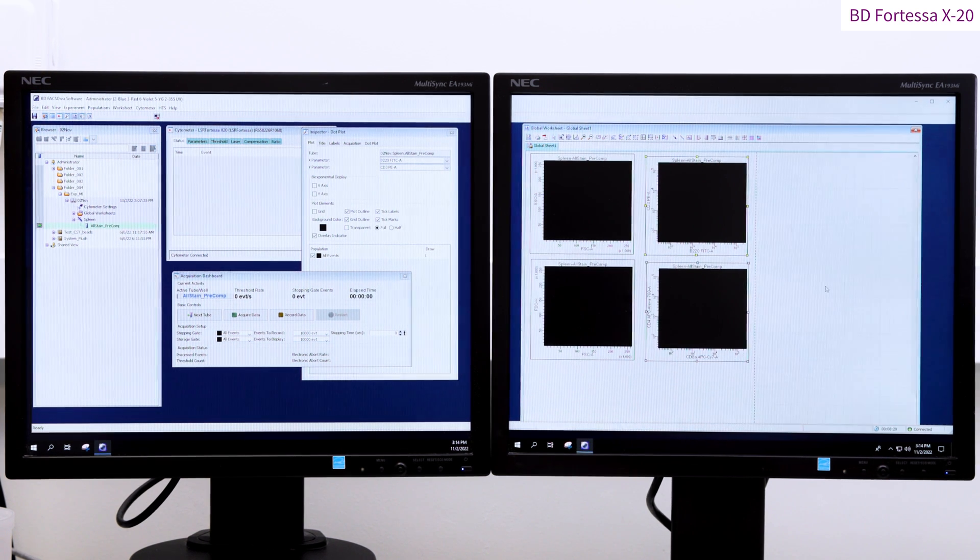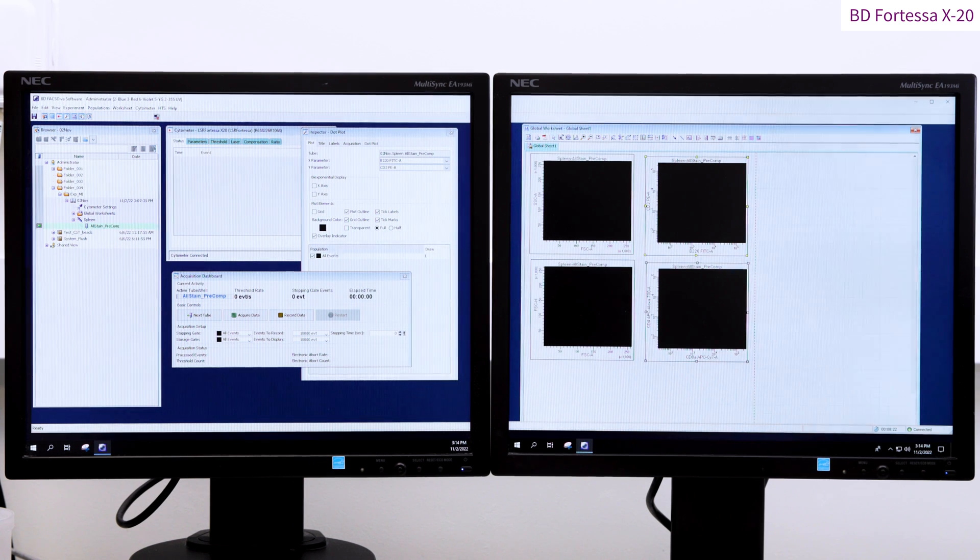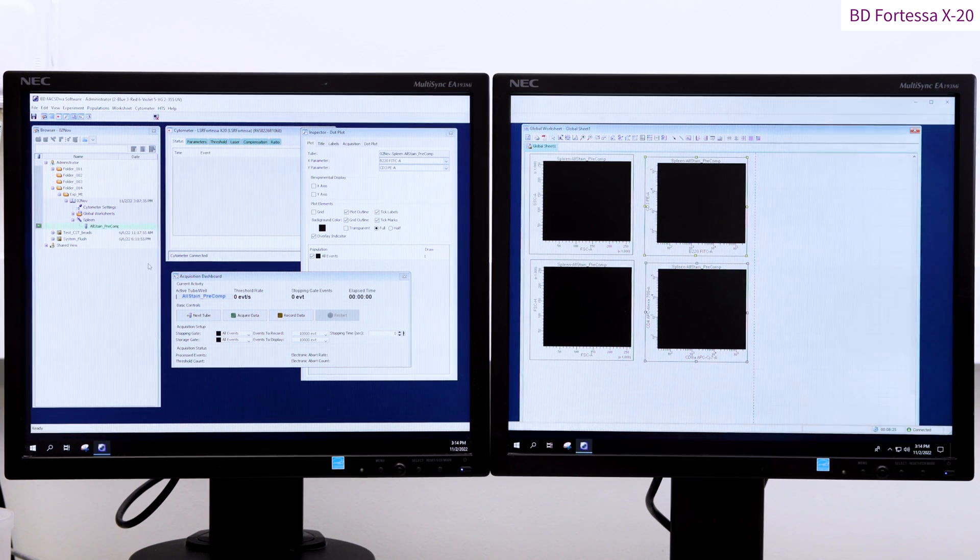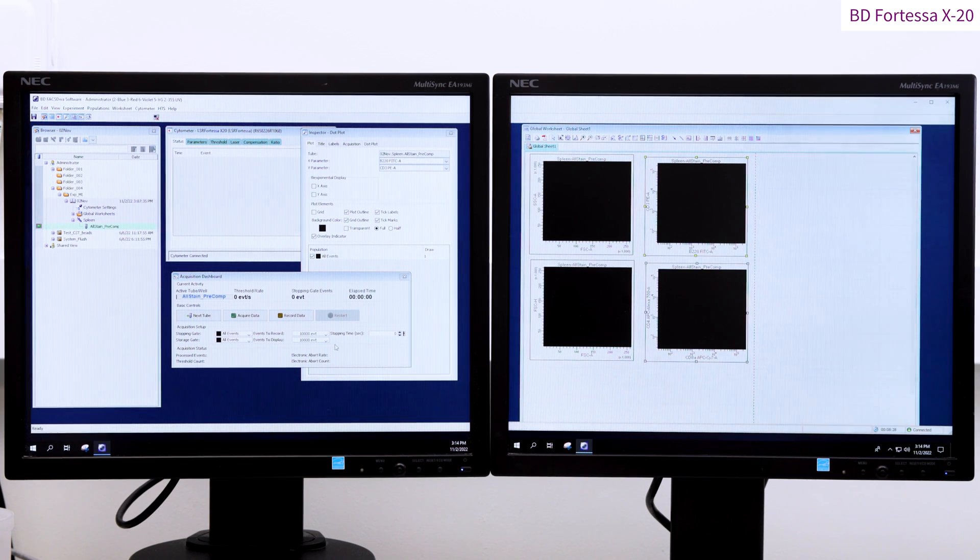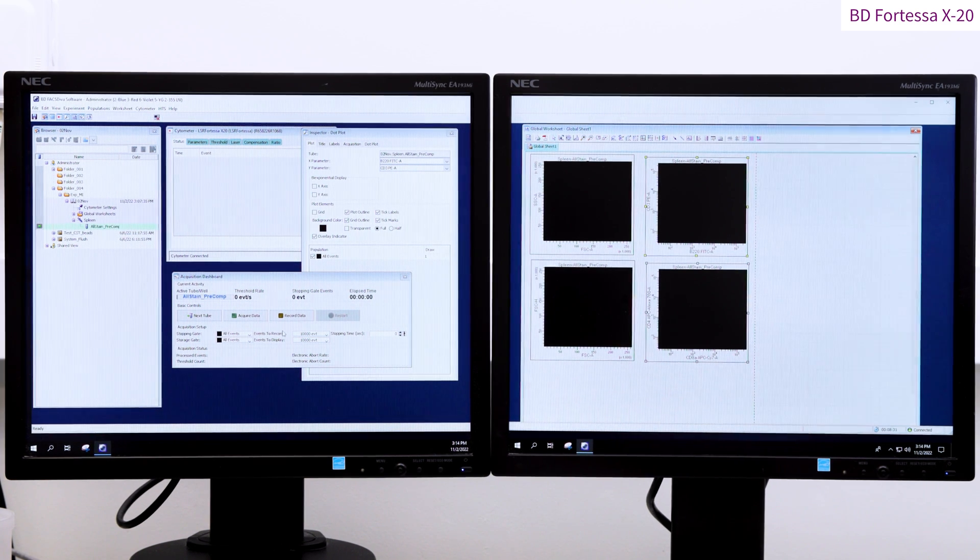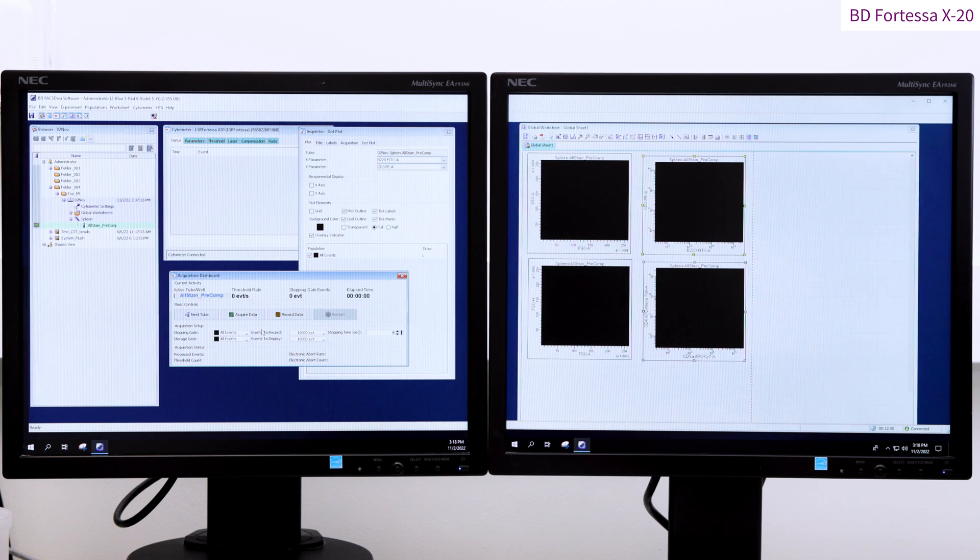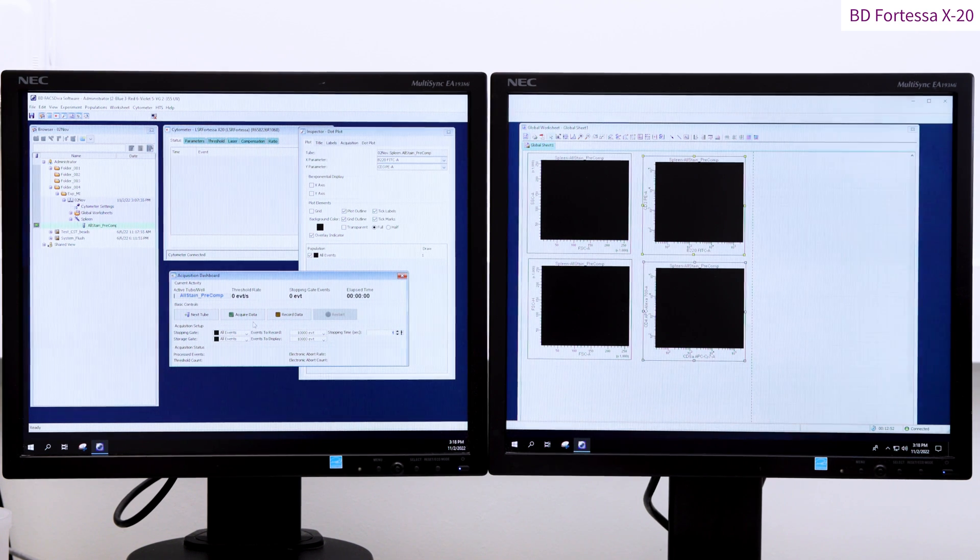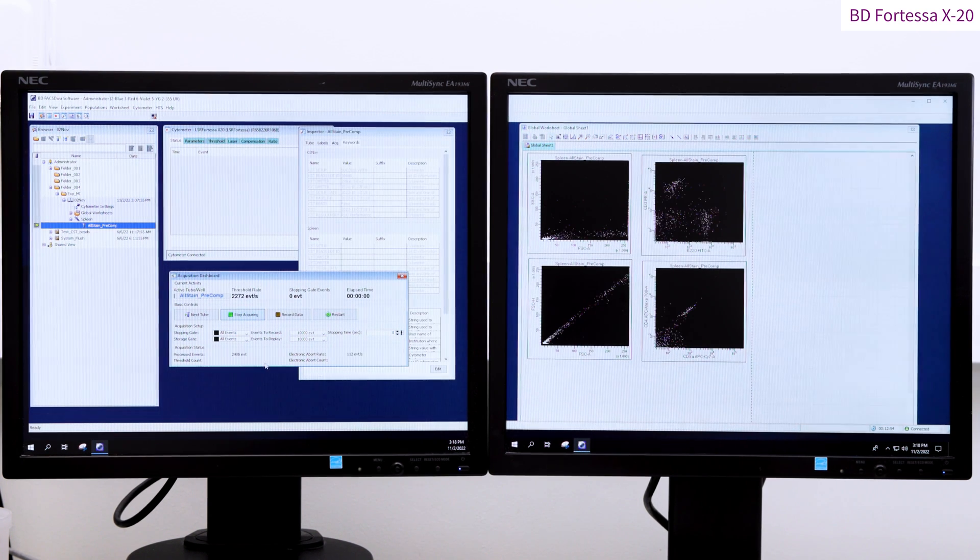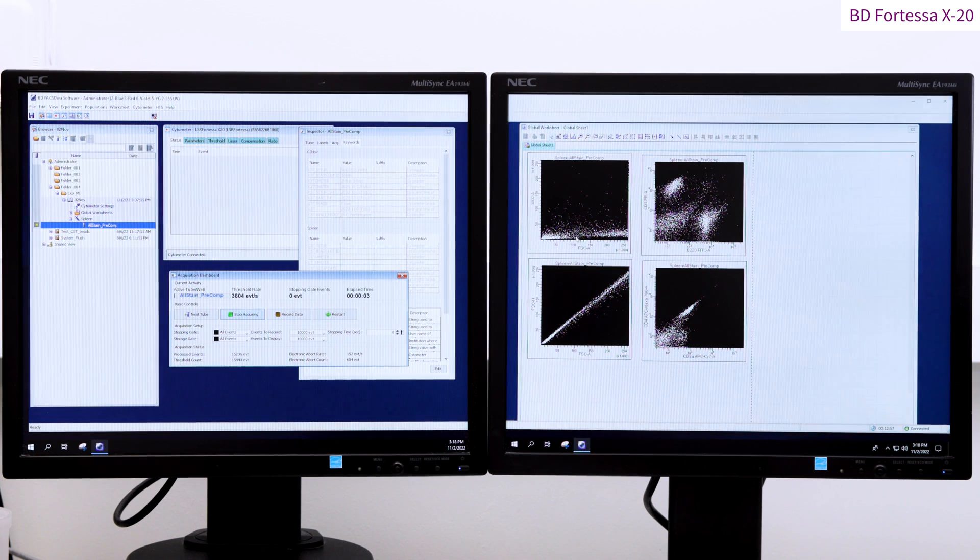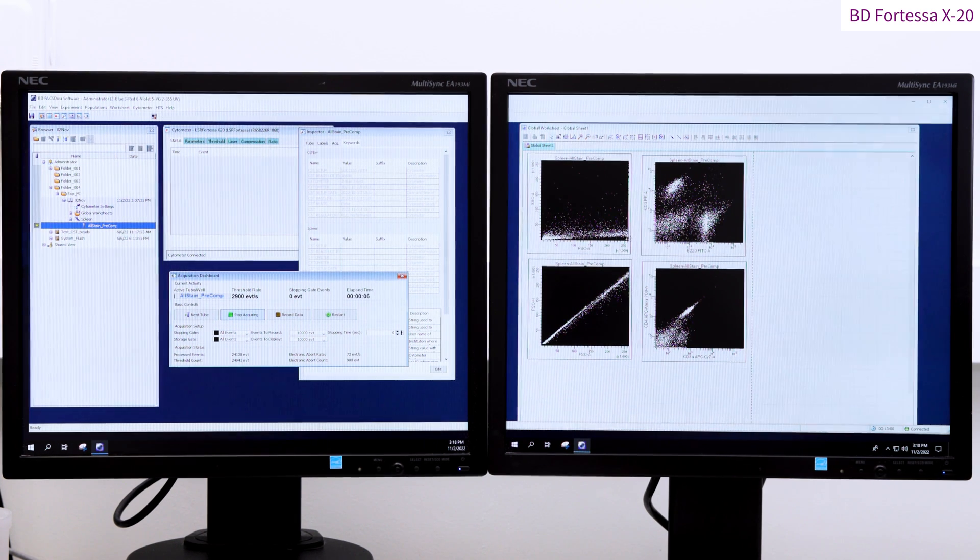By the acquisition dashboard, you can set up the number of events you would like to record, for all of the events or for any specific gates you might have set up. You can also set an acquisition time limit. With the sample tube on the SIP, press the acquire data button.